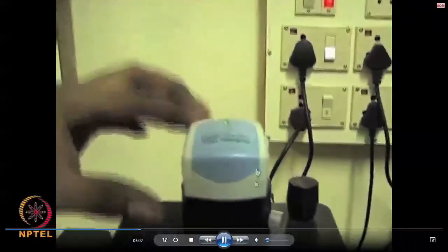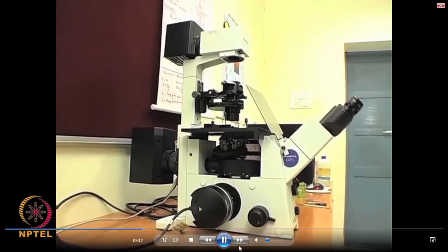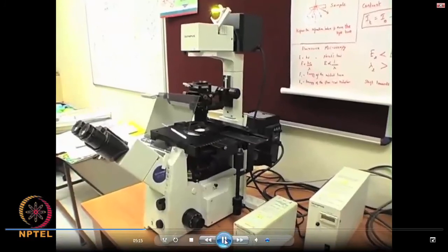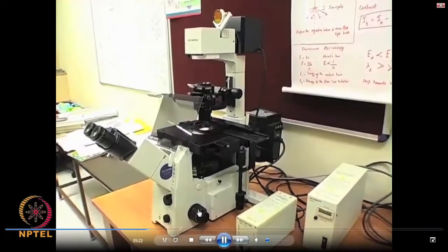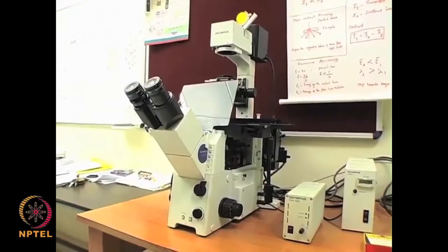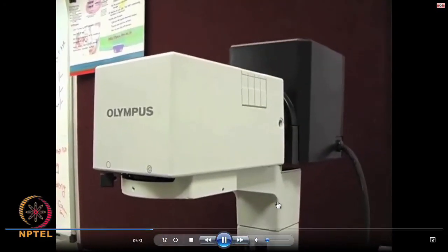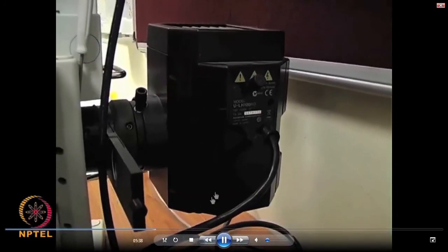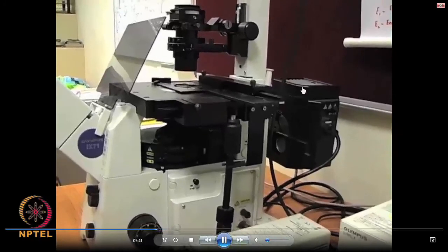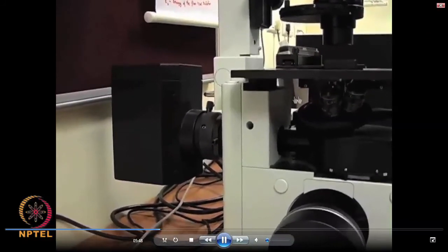Here again, for image grabbing, you have the CCD camera attached to this. What you are now seeing is another type of microscope, called a transmission optical microscope, which is very different from what you have just seen before. That is, one is vertical, another is an inverted microscope. Here you have two types of illumination attached to it: one is a mercury lamp and the other is a halogen lamp on the top.